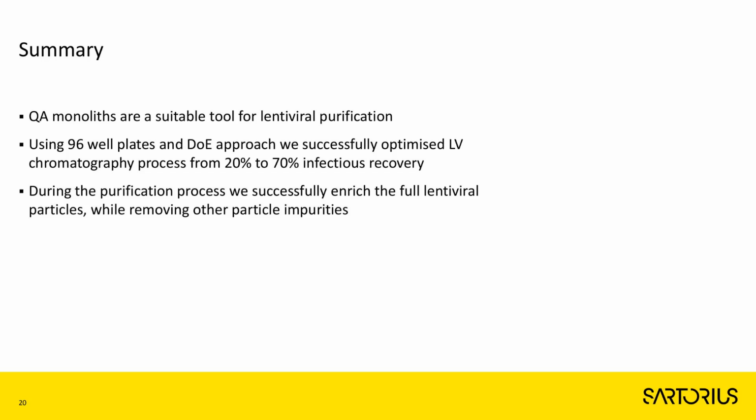We have shown that using the 96 well plates and the DOE approach, we successfully optimized the lentiviral chromatography process and increased the infectious recovery from 20 to 70%. And we have also shown that during the purification process, we successfully enrich the full lentiviral particles while removing other particle impurities.